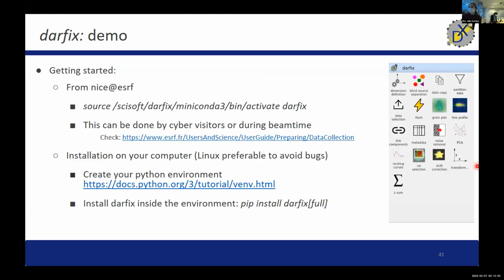If everyone has succeeded in opening remote, in opening Guacamole, we will start with the demonstration. I think no one had a problem because no one told us anything. So we can go after you have allocated. Maybe I will share my screen with what I'm doing. So stop sharing here.